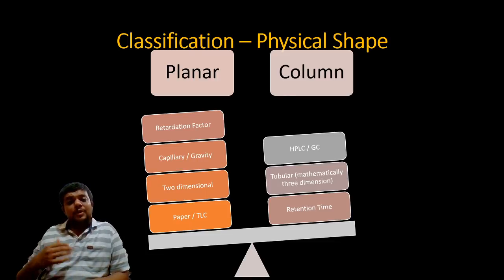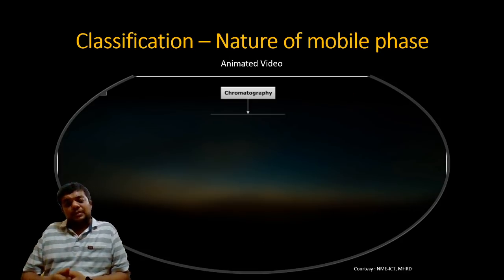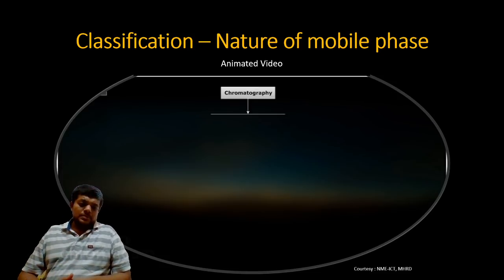So now moving towards the third classification method. As I told you, before every movement that we make in this series of lectures, I have collected a few animated videos, and the nature of the mobile phase classification basis has such a wonderful video, which we will see first in this animation and then move ahead.